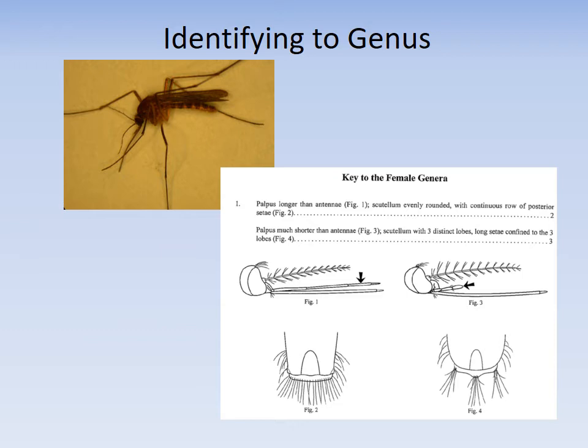So let's look at some of these characteristics. The very first characteristic is usually the most important characteristic in this differentiation. Sometimes there's only one characteristic. Sometimes there are multiple. A lot of the time the second, third, and fourth characteristics tend to be a little bit more detailed. I'm not going to say they're less important, because they are important, but they could be harder to tell. And you don't always have to go through every single one of them to make sure.